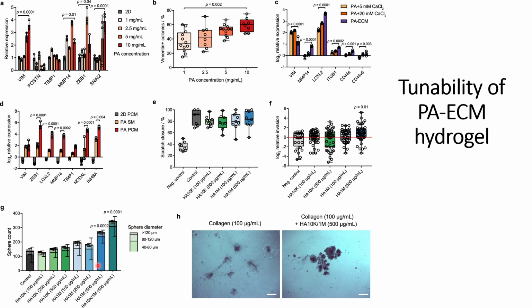The number of spheres increases with increasing HA concentrations.